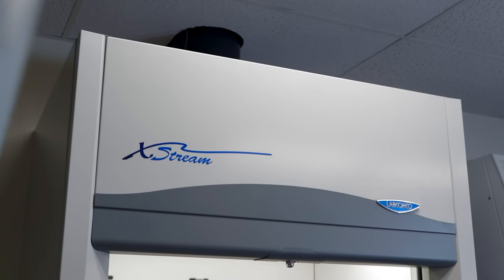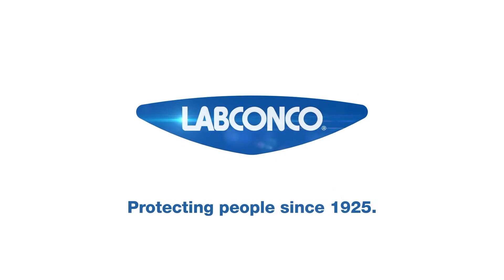Make sure you're familiar with fume hood safety procedures before operating your LabConco fume hood.